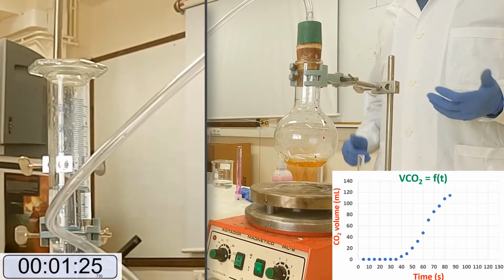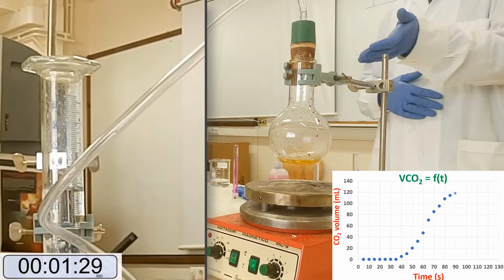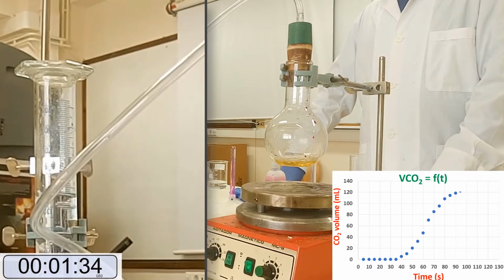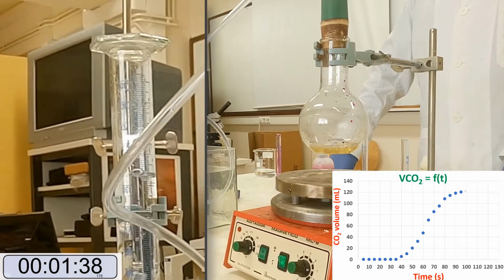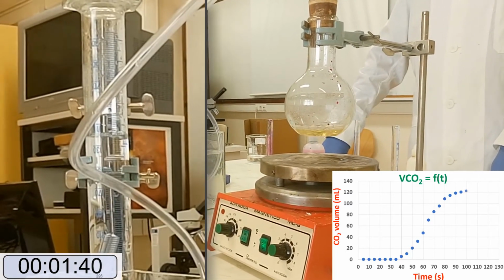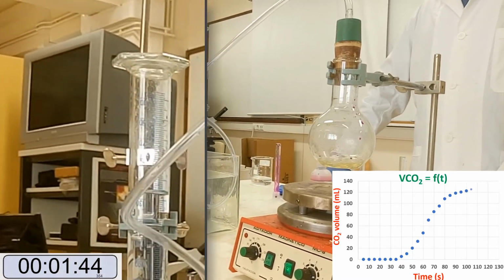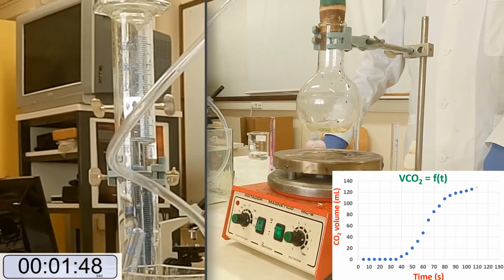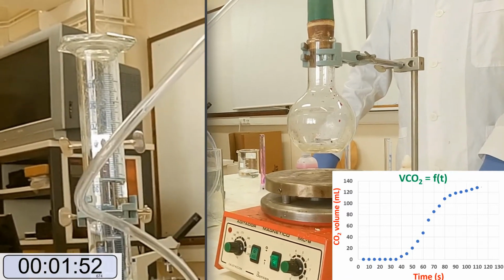For a better understanding, CO2 volume over time is plotted. This experiment is a very useful educational tool, since students themselves can observe the experiment live and review the video later and plot a graph of carbon dioxide volume as a function of time.